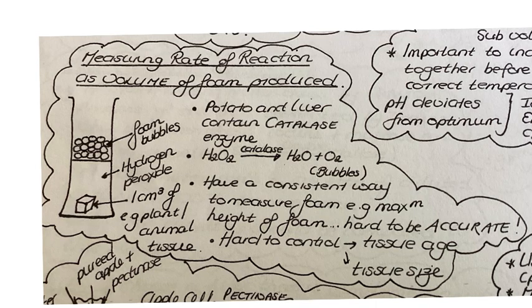Okay, I'm just going to quickly talk you through a couple of different kinds of enzyme reactions. So this is measuring the rate of an enzyme reaction by measuring the volume of foam that is produced. Now this would come up now and again in papers.